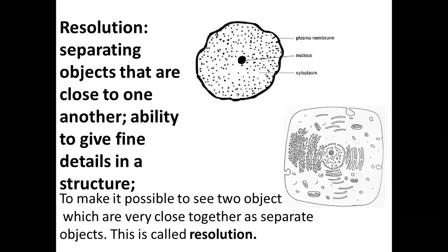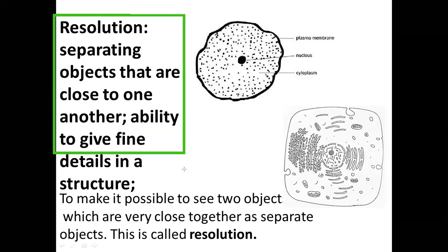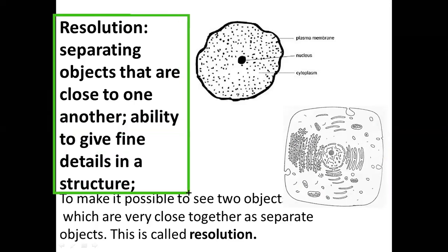Now, resolution is separating objects that are close to one another, or simply the ability to give fine details in a structure.